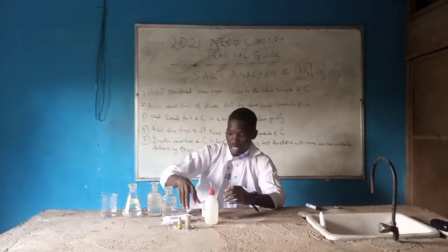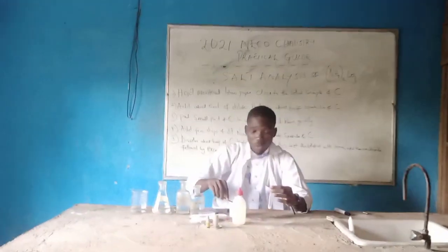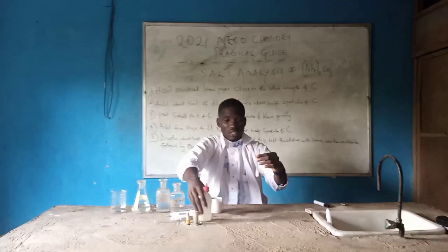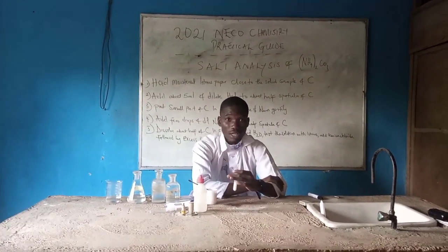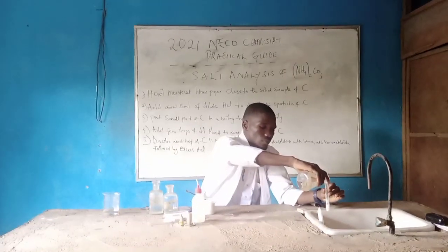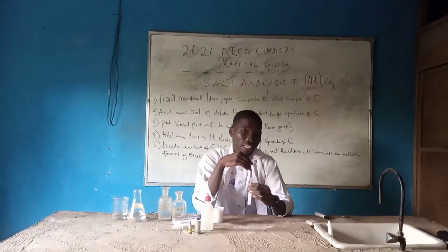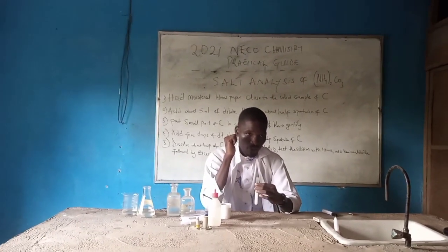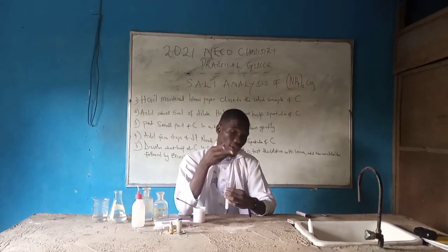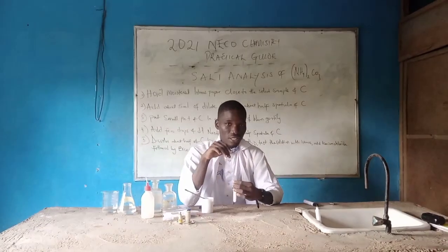So let's take a look at the observation. Here is our sample C — we pour it into the beaker with a little distilled water. These are sample C with distilled water, plus a few drops of sodium hydroxide. As you can see, what I am perceiving here is a choking or irritating smell. That is the observation: it has a shocking or irritating smell. As I told you earlier, when we are using baking powder in place of ammonium carbonate, it takes time before the red litmus paper turns blue.